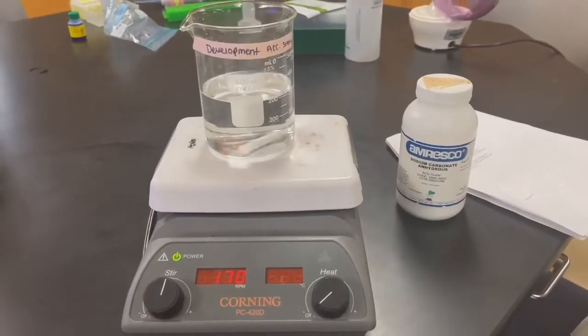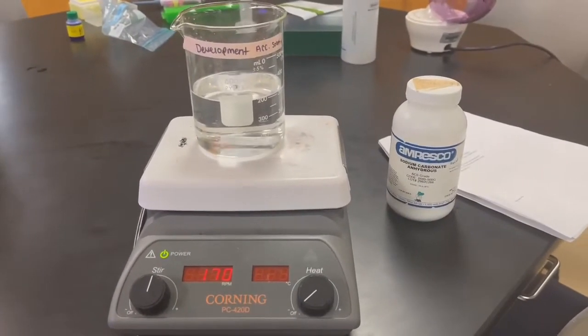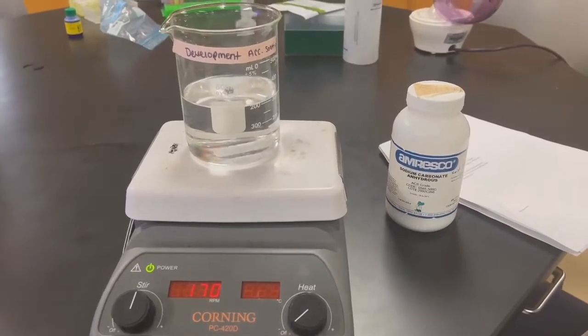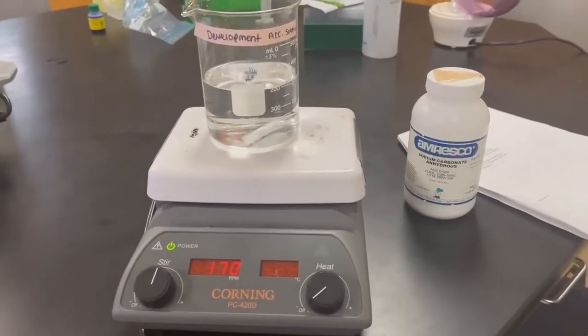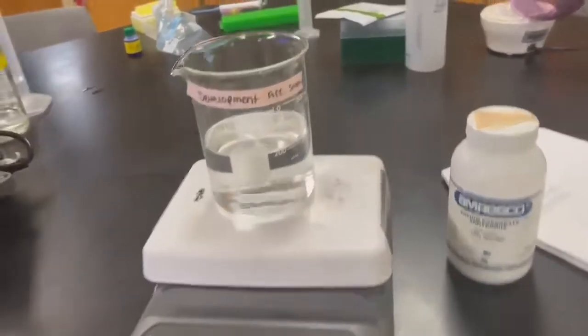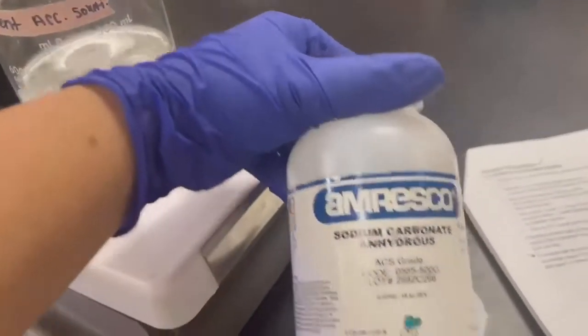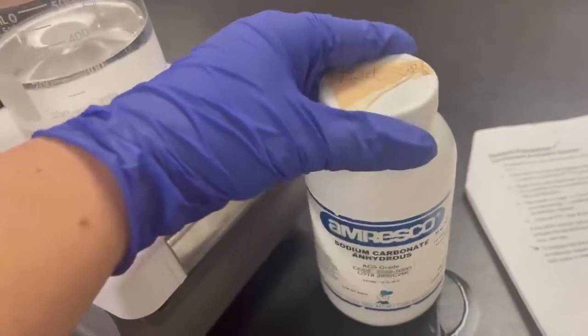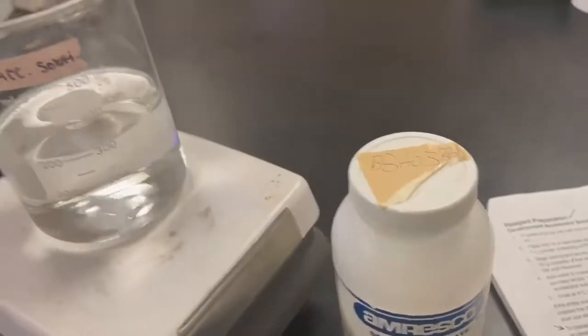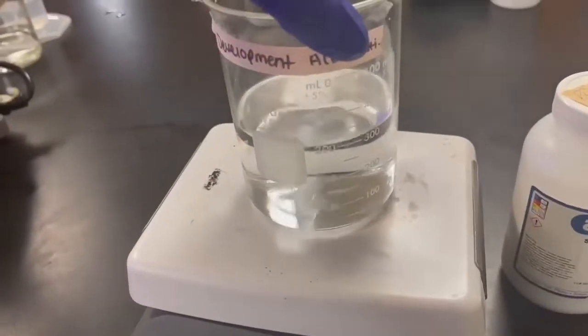The staining procedure that we will be using to stain our gels is called a silver stain. The first step in creating your silver stain, you need to create a development accelerator solution, which is a simple combination of sodium carbonate, 25 grams of sodium carbonate and 475 milliliters of deionized water.